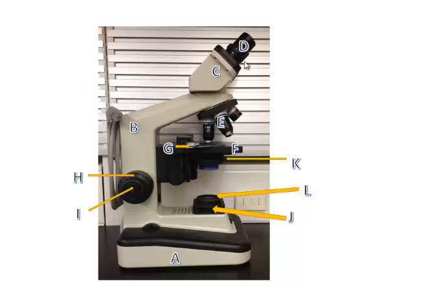Here we have the ocular lens. Here we have the objective lenses. In order to get the total magnification of an object, you take the ocular lens magnification and multiply it by the magnification of the specific objective lens that you are using.